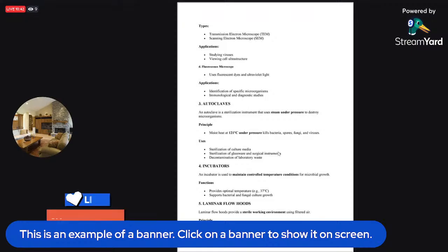They operate under that because there are some microorganisms, especially some thermophilic bacteria, that survive even if you heat.